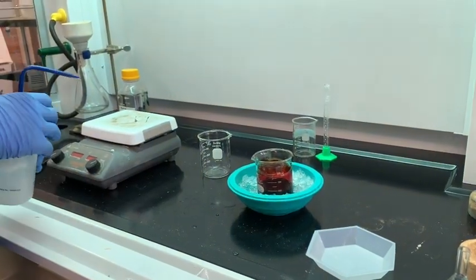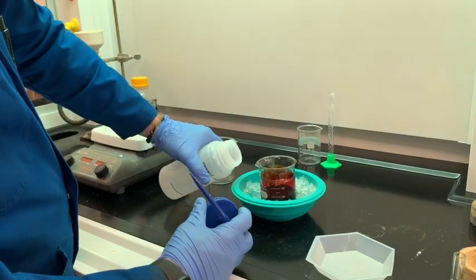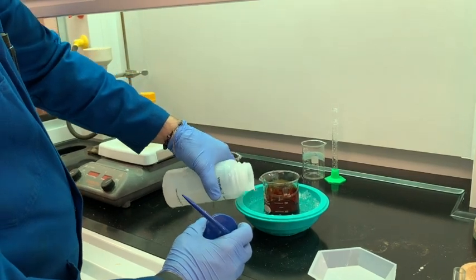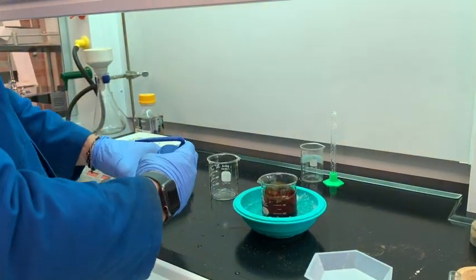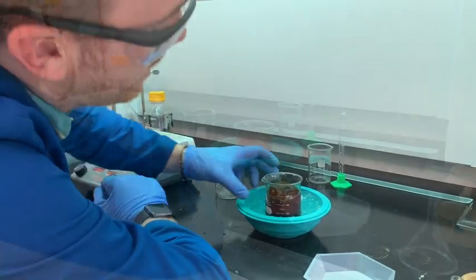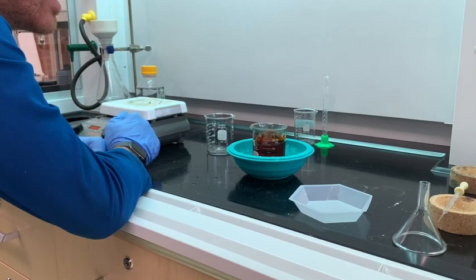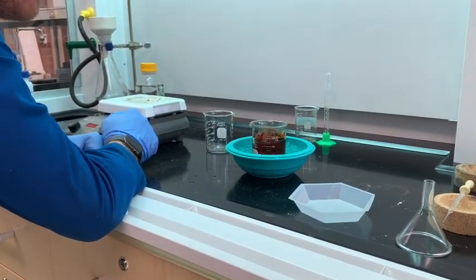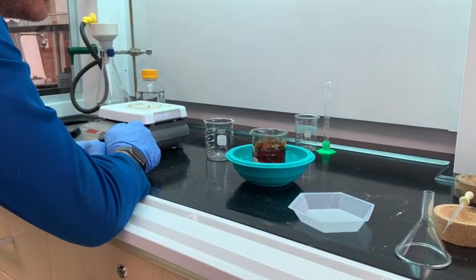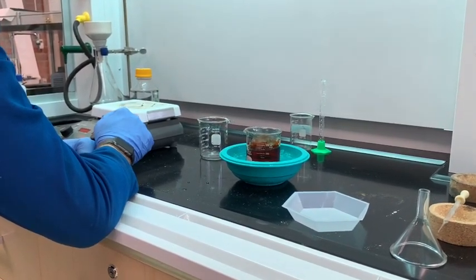Whenever you do these filtrations, it's good to start with product that's been especially well cooled because it'll be less soluble and you don't want to lose any product into your filtrate. You also want to always add water to your ice baths just to make sure you get maximum surface contact with the edges of the flask. If you want maximally crystalline product, always crystallize slow and crystallize as dilute as possible. If you want good crystals, if you want maximum product, get it as saturated as you can and just do your best when it comes to slowly cooling it and allowing stuff to fall out of solution.